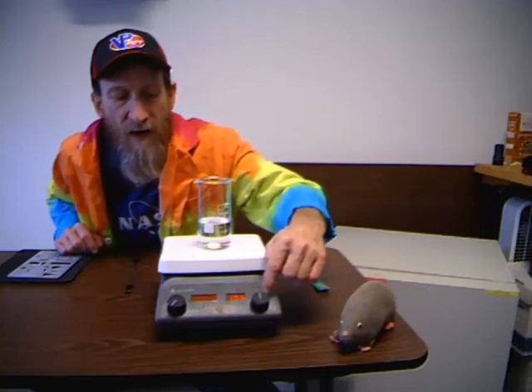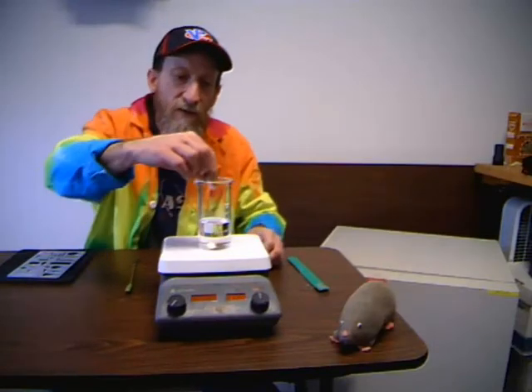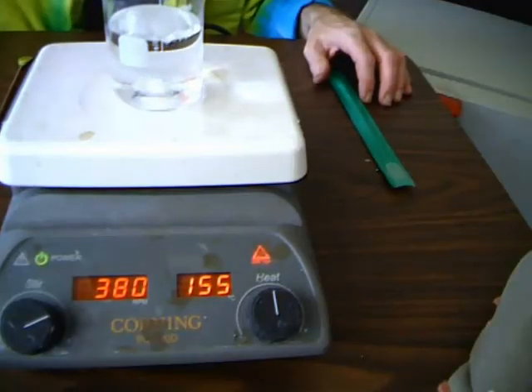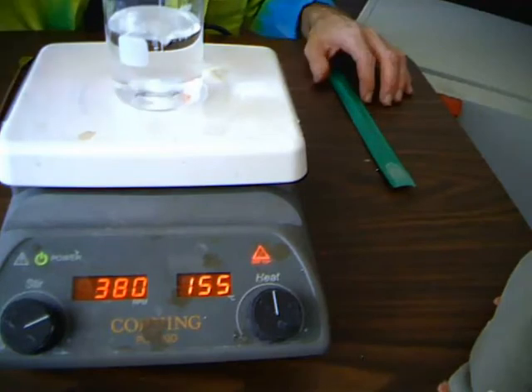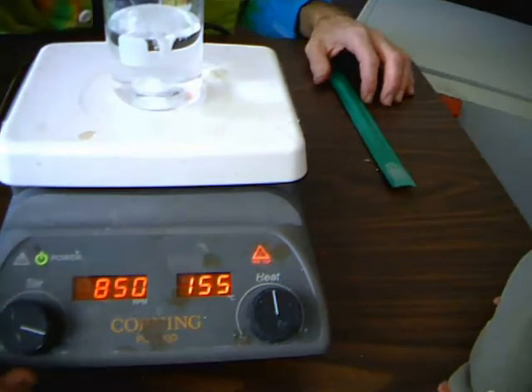This hot plate is nice because it actually has a digital readout showing the temperature you can set it to. A lot of other hot plates don't have that — they just have 1 through 10 on the knob and you have to adjust to figure out how fast it heats up. Another function is the stir setting. I have a Teflon-coated magnetic stir bar — we simply drop that in and turn it on. Now you can see that besides the hot plate getting hot, it's also stirring, and you can adjust the speed of the stir bar in RPMs.